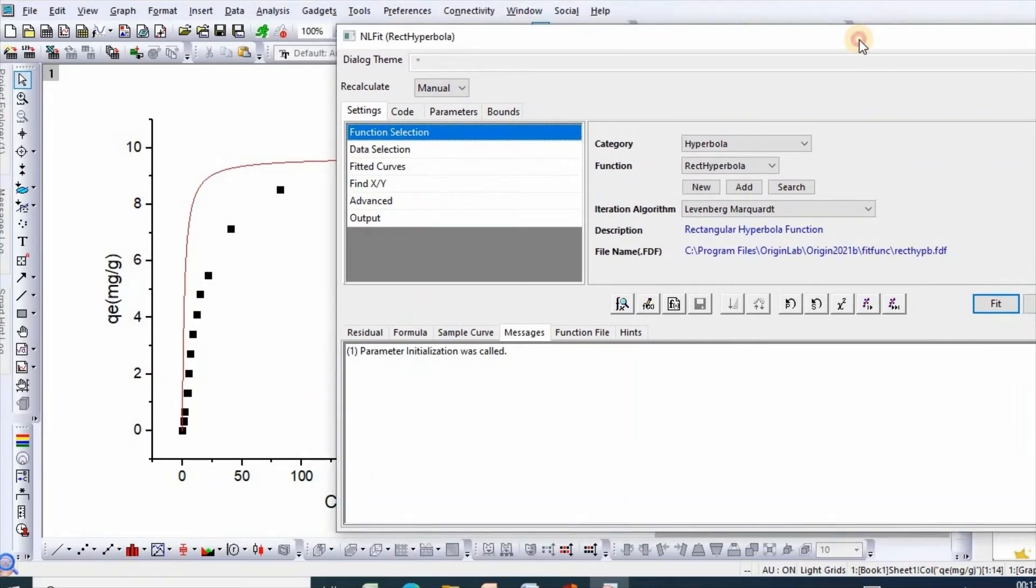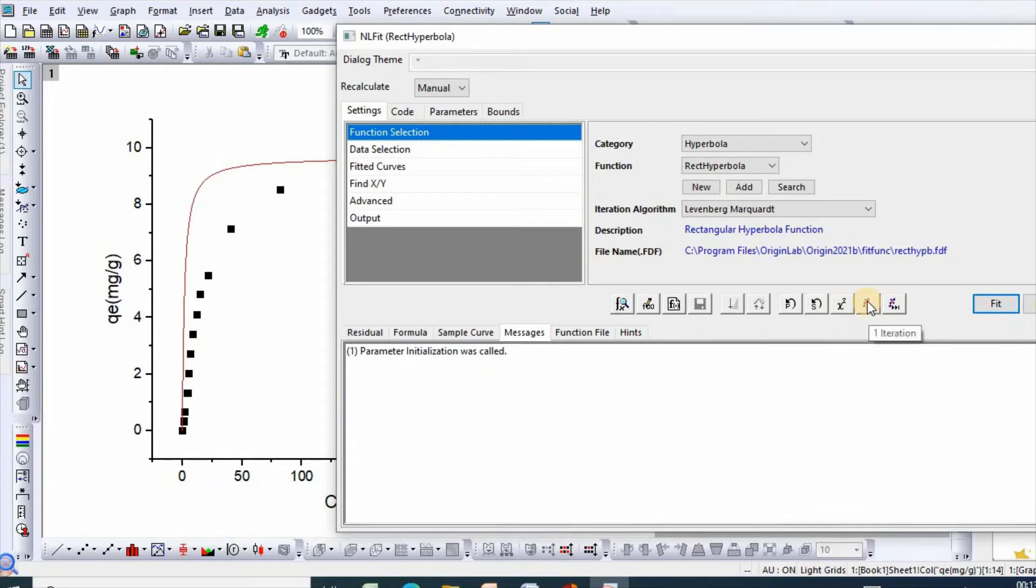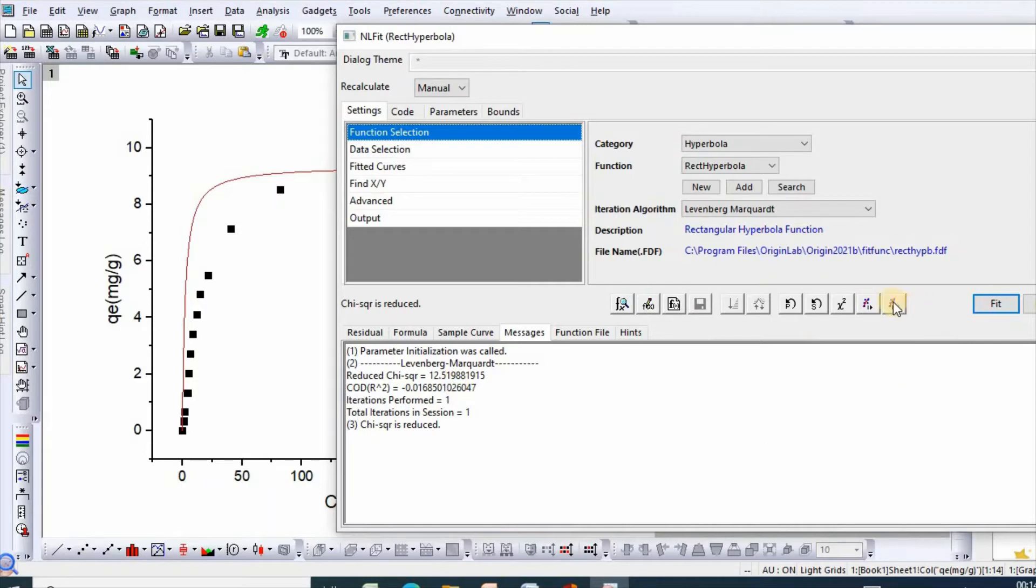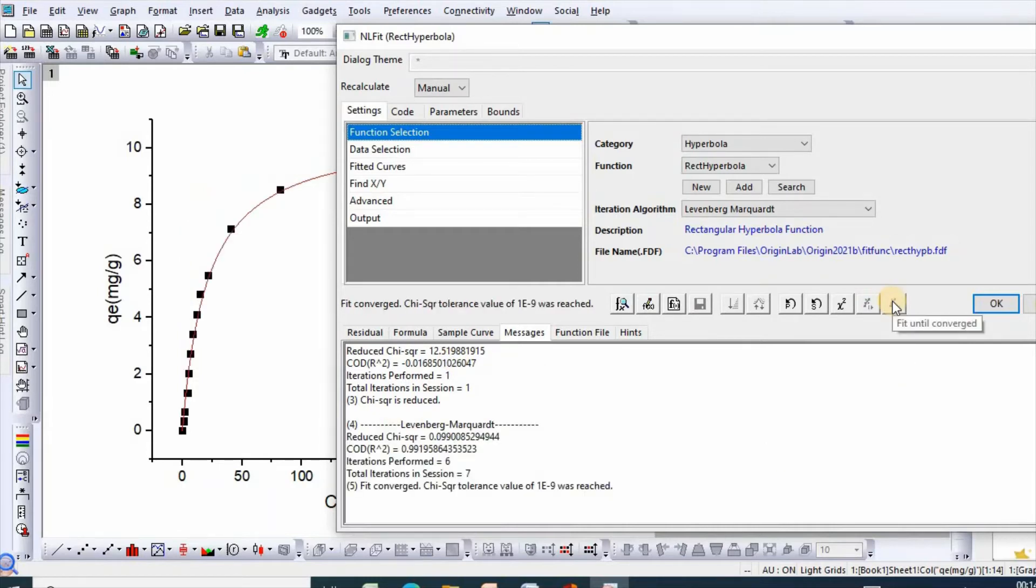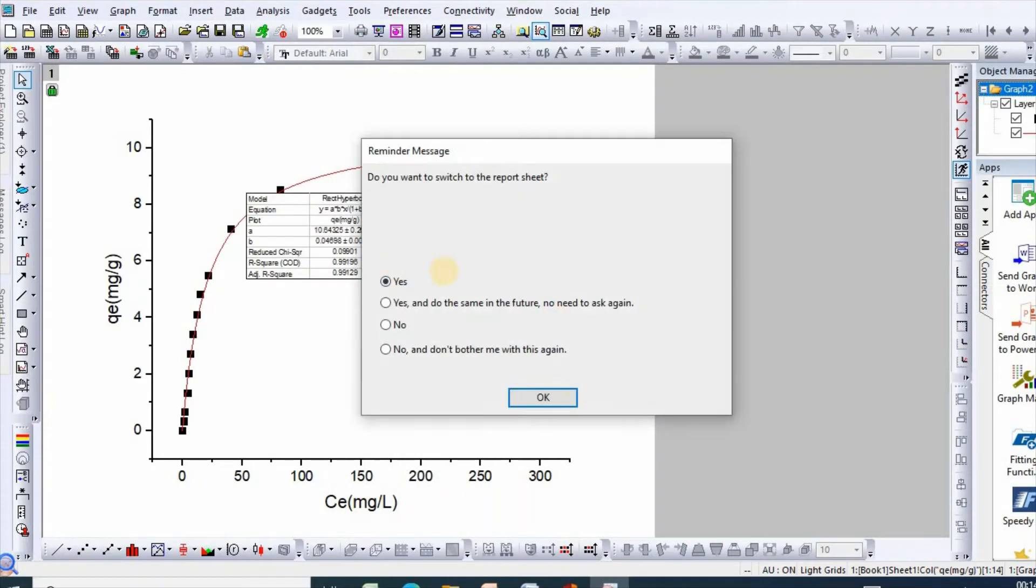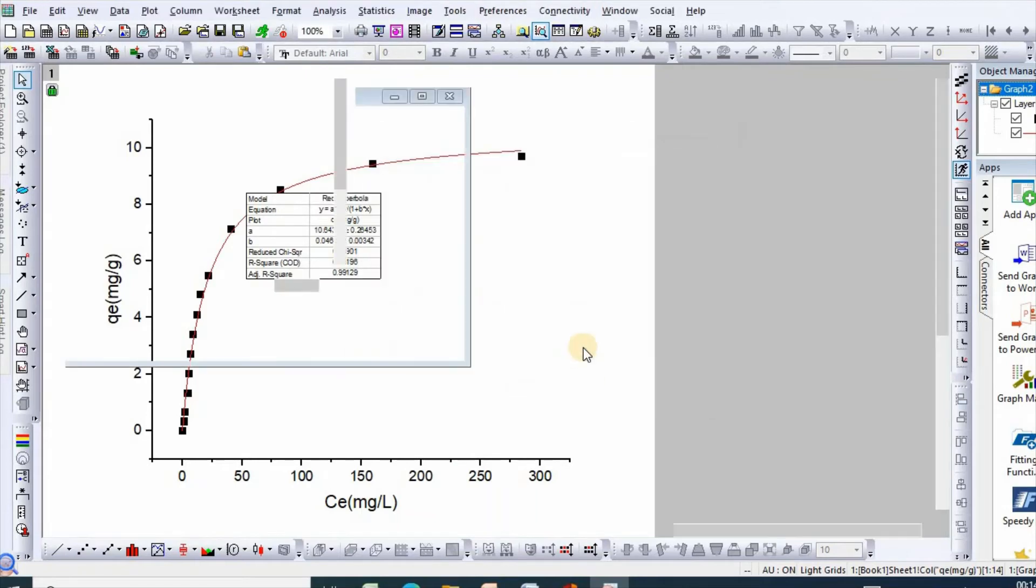Now see, it is chi square and the number of iterations. Click first iteration. See, reduced chi square has been 12.5. Then click Fit Until Converged, then click OK, then click Yes.